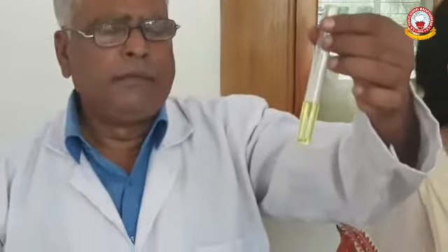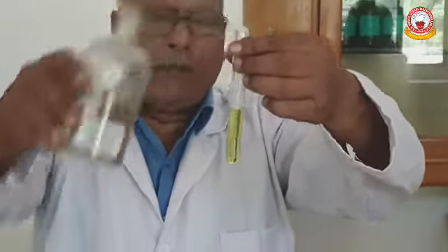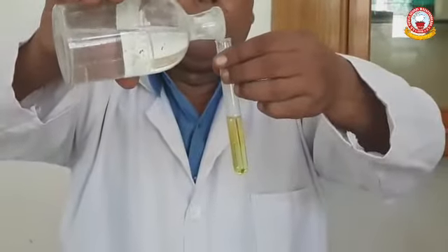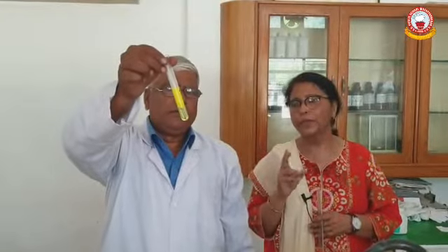Now we will add 2 more reagents to it, that is acetic acid and lead acetate. So, with acetic acid and lead acetate, children, you get a yellow precipitate, that is of lead chromate, and it confirms chloride radical. So, very important chromyl chloride test, confirmatory test for identification of chloride.